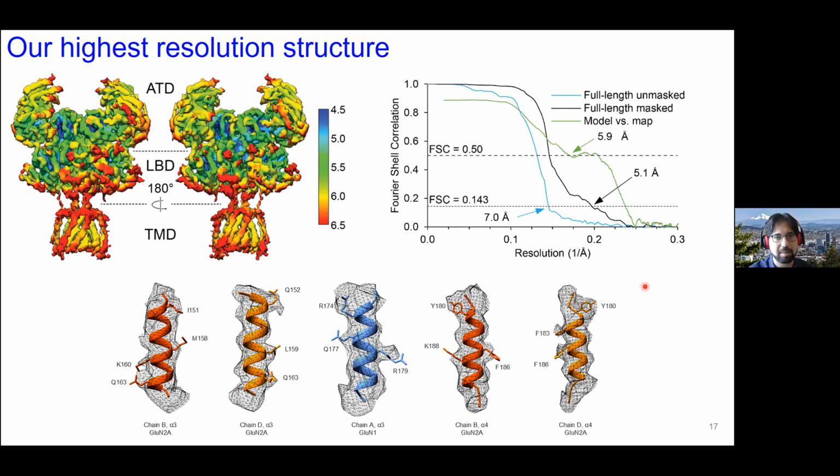The highest resolution structure that I had in this project was around 5.1 angstrom, and I'm showing it here. It belonged to this 2-knuckle, not bound by zinc conformation. You can see some helical pitches, but they aren't great, and there is some density for maybe bulky side chains. But again, there is a lot wanting in this structure.